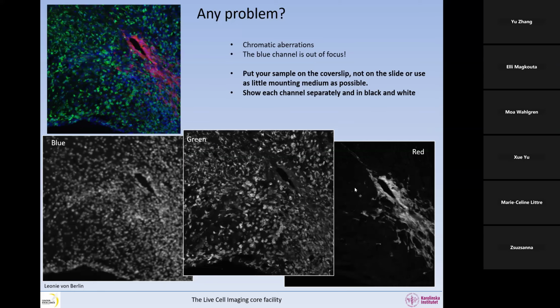And then clearly show the channels one by one in black and white so that people can actually see what you want them to see.